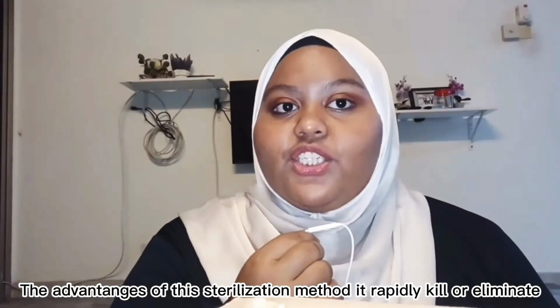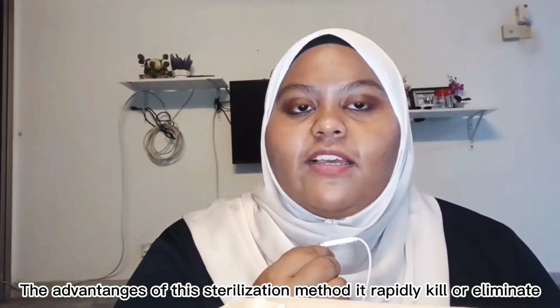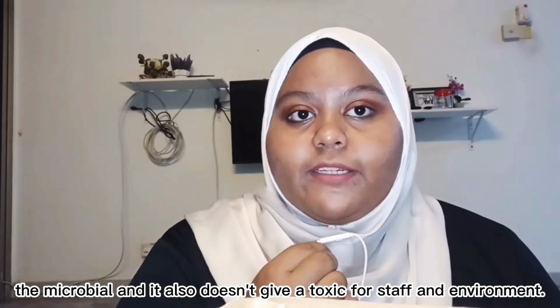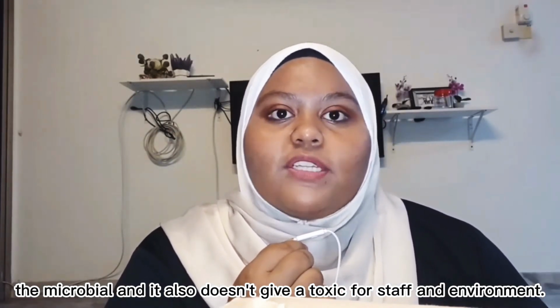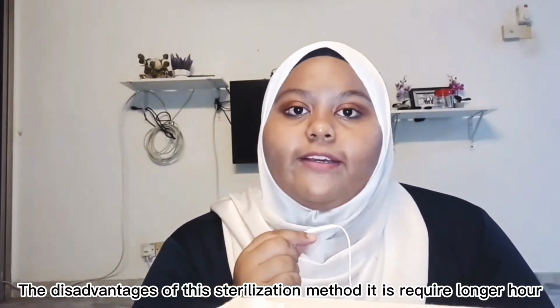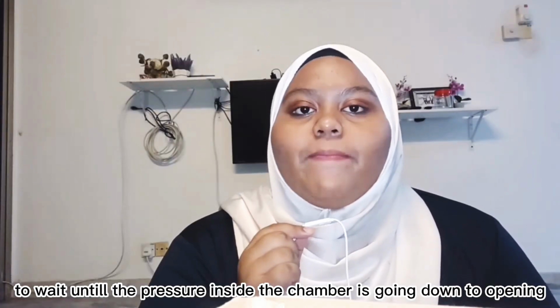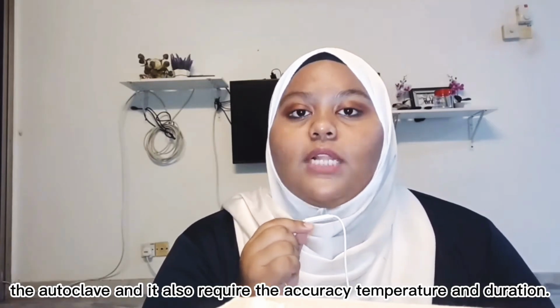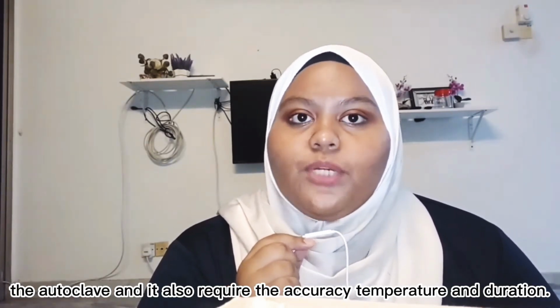The advantage of this sterilization method is that it rapidly kills or eliminates the microbes, and it also doesn't give toxic effects for staff and environment. The disadvantage of this sterilization method is that it requires a longer time to wait until the pressure inside the chamber goes down before opening the autoclave, and it also requires accuracy in temperature and duration.